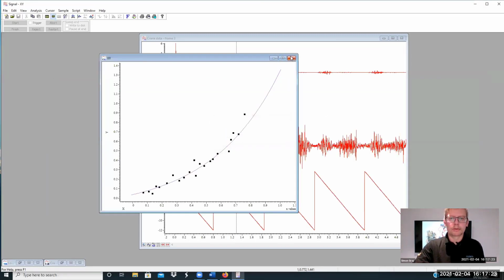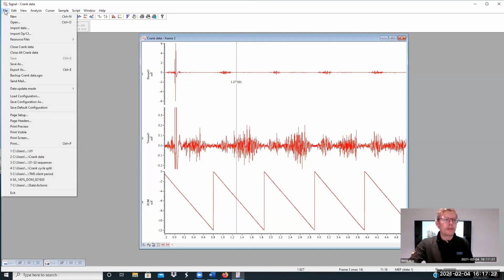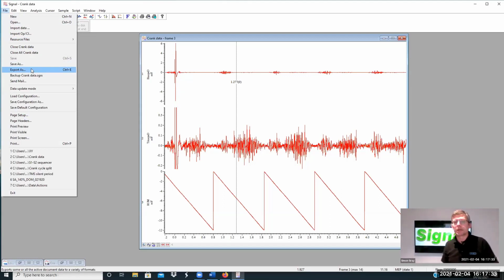Okay. So that's that. Right, moving down the file pull down, export as. I had somebody just yesterday asking how they could delete certain frames in the file. My answer to her was simply, well, you can imagine this is an area that we make a little more difficult than others, because who would get the blame if data was deleted?